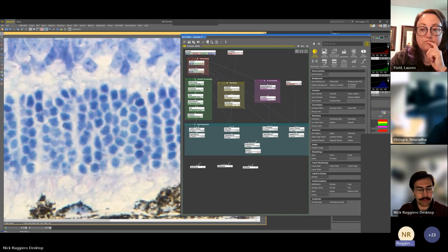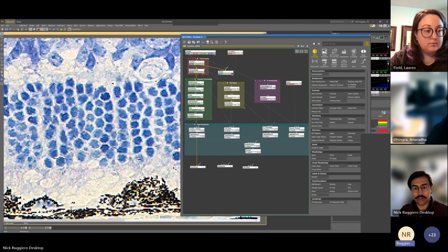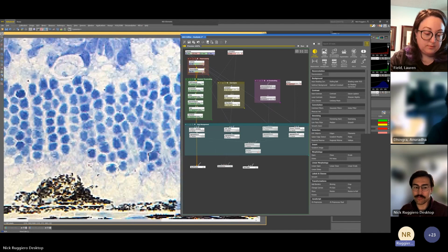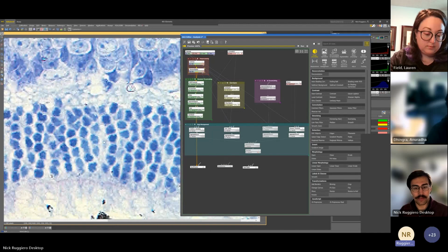It still looks a little bit blurry to me, so at first I tried to do just a regular sharpen, and you can see that starts to look really over processed and not exactly what I'm looking for. So I ended up taking that out, and I used instead a sharpen slightly. This looks way better to me. It's looking maybe a little bit processed, but I think this will be way easier to threshold out. And that's what I found when I was doing this threshold.